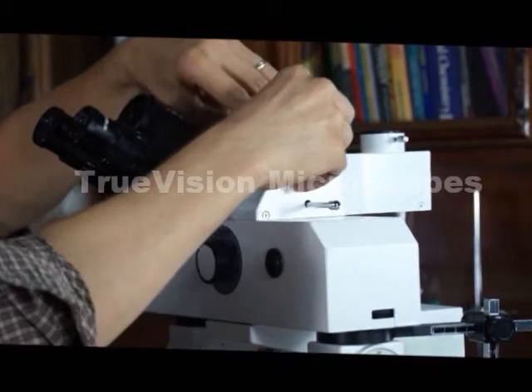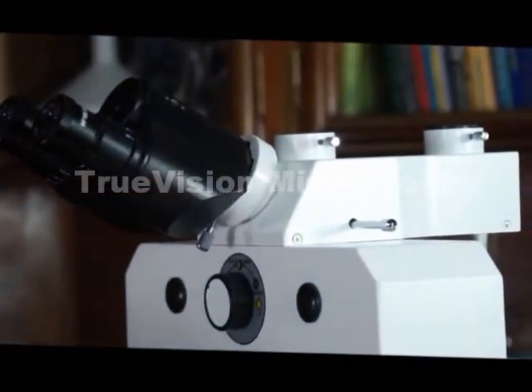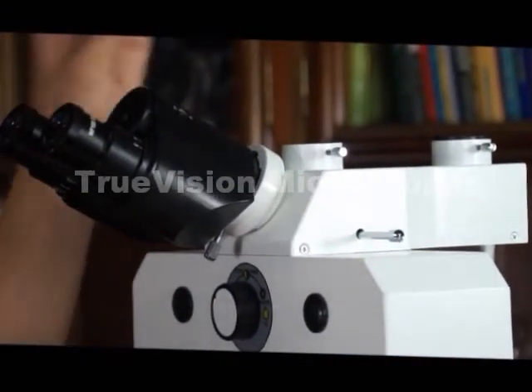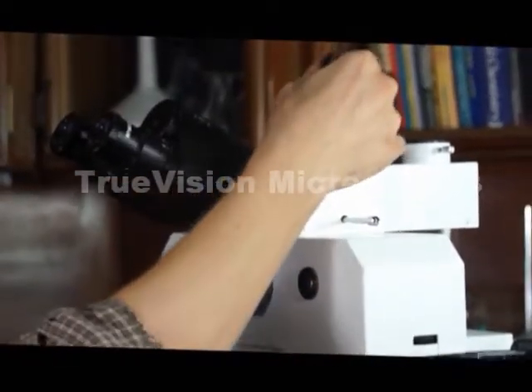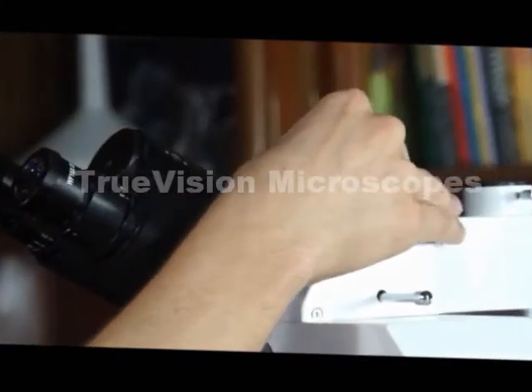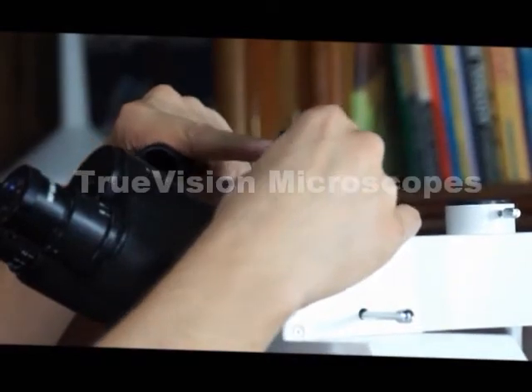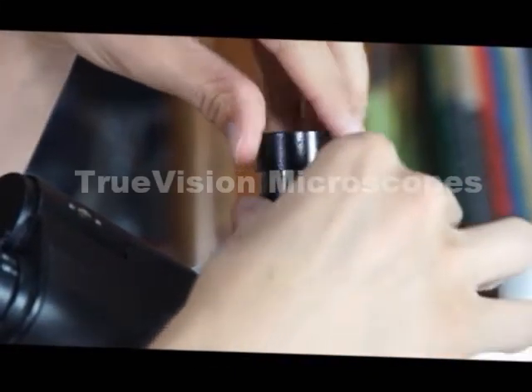We have another port at the front. That port is for video. This is a C-mount adapter. At this point, these threads will connect directly to a C-mount camera. This is a photo port, so some types of cameras will slide right into this opening.